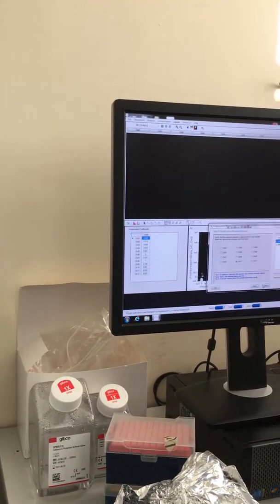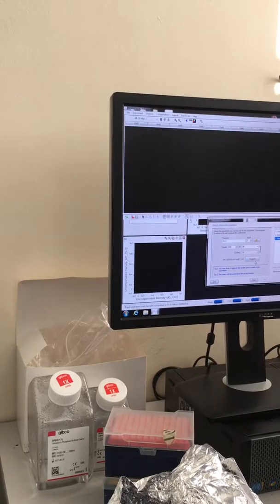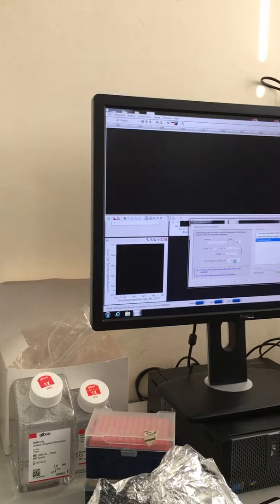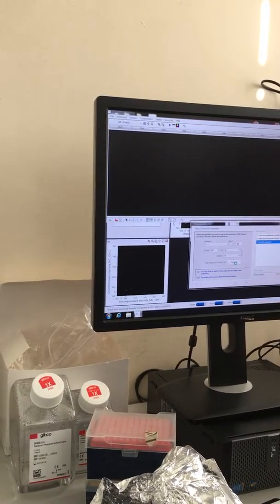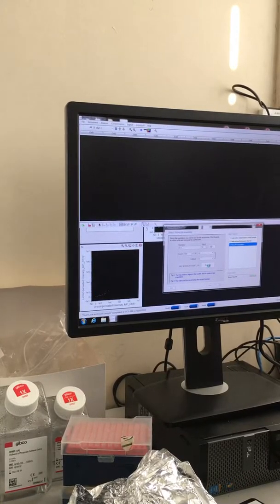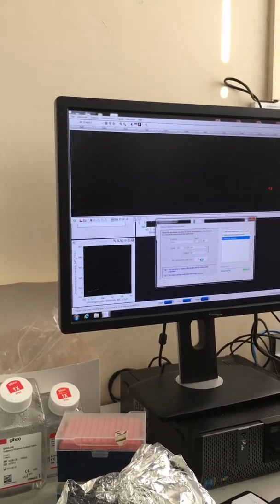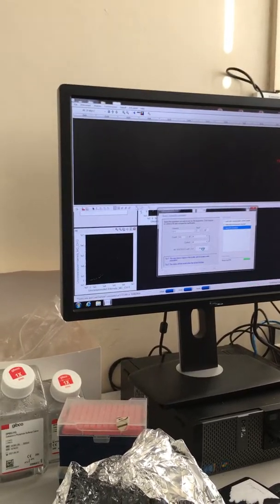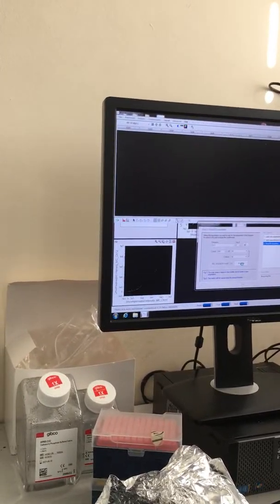Yep. So hit next, acquire. It shouldn't take too long. It's good that I don't have to pick the channel. Sometimes you have to override it and say I want you to be in this channel, but more often than not, it's okay.